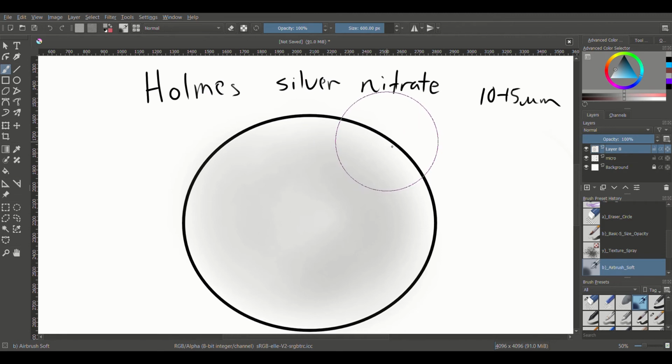We're going to let that incubate overnight. And then you're going to take that out, shake it off. You're not going to see a whole lot of difference here, really. You might see a few lines here and there at this point. So let's just say you see a few neurofibrils here, but really not a whole lot.